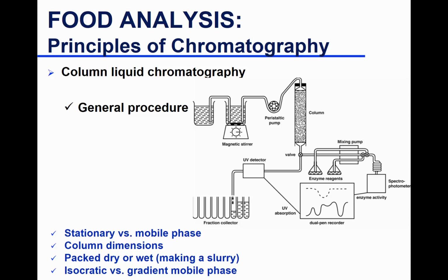So it's really an art, and it requires lots of training to be able to do that, where you pack your stationary phase adequately so that there are no empty spaces or vacuum or bubbles, and it is consistent, to allow for good resolution.